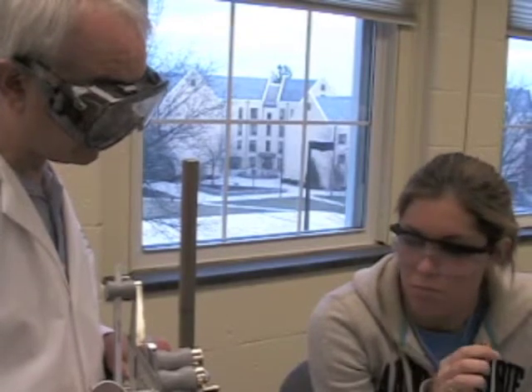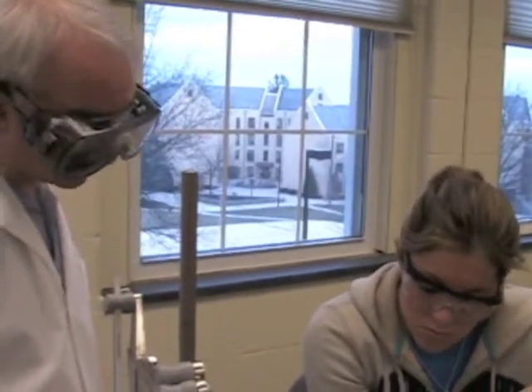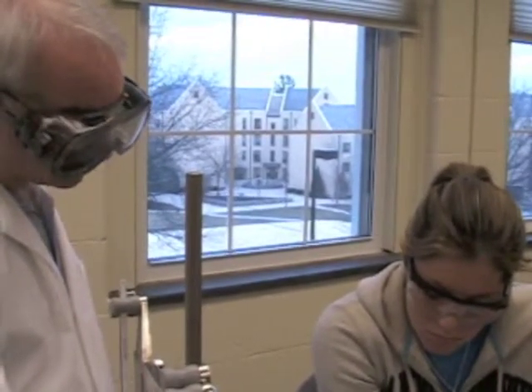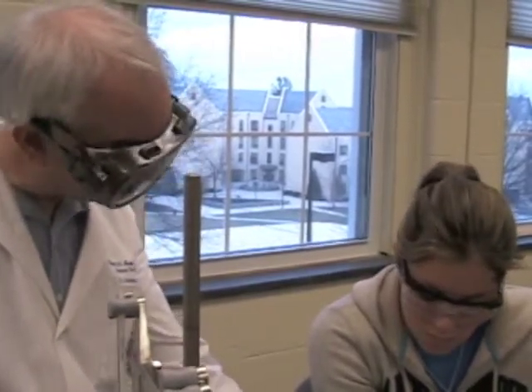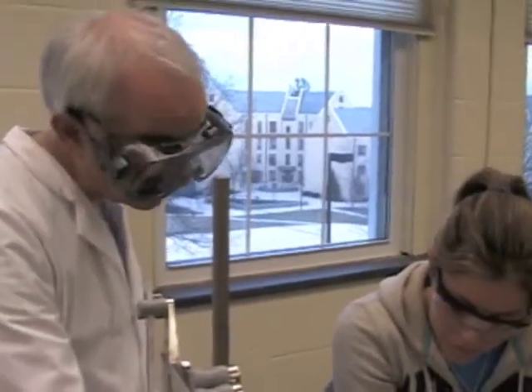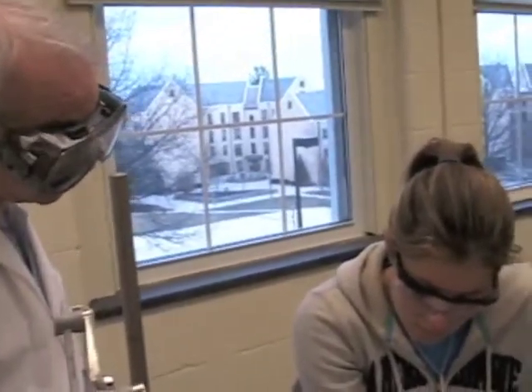You have to use the water vapor, the change in enthalpy. Like isolate the change in enthalpy, but not the vapor pressure and the volume. Well, we need to calculate the change in enthalpy. We don't know that until the end. So we have to do that by getting just the water vapor pressure. The total pressure in there, we're going to assume that's the same as the pressure outside, the atmospheric pressure. So we're going to find out the air pressure and subtract that from the barometric pressure to get the water vapor pressure.